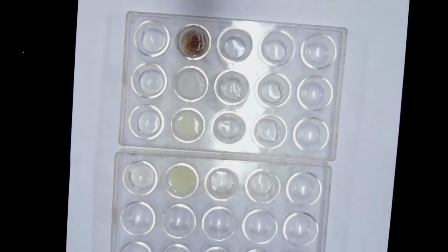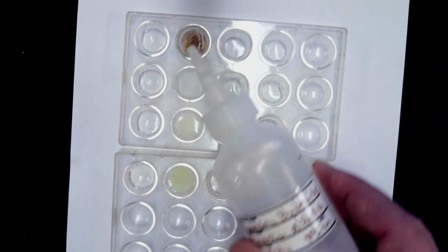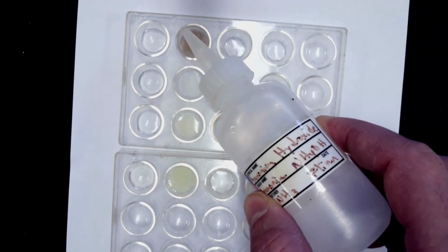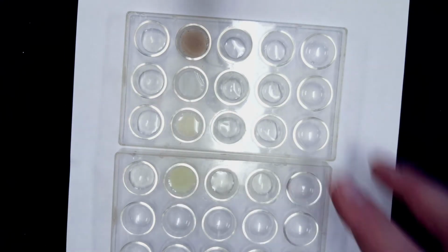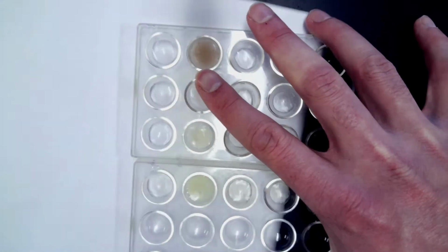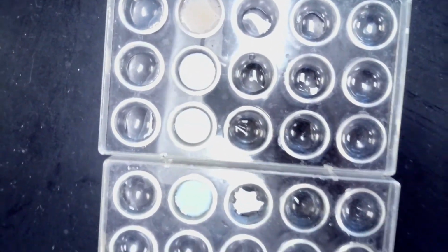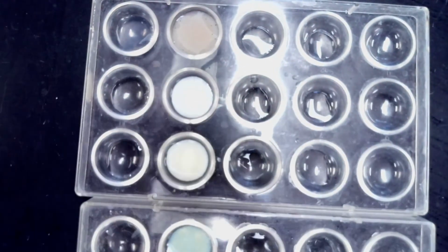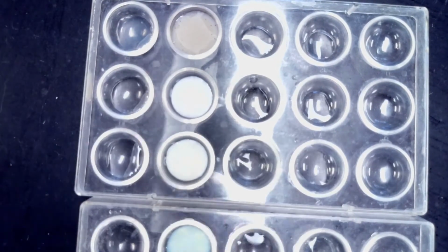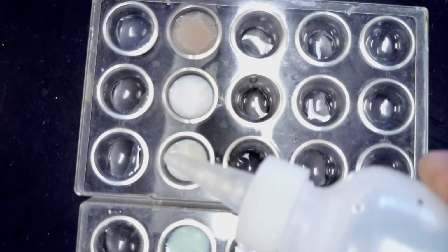We're going to add ammonium hydroxide next. So you can see the top one was brown. It has a brown precipitate. I believe that one had a white precipitate. So you can see the brown precipitate kind of left. Okay. So you can see the first one had a brown precipitate that disappeared, the next two have a white precipitate, and the bottom one has kind of a creamy precipitate. And again, use PPT to abbreviate precipitate.